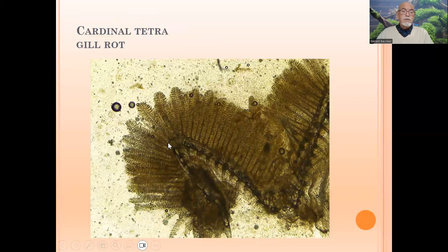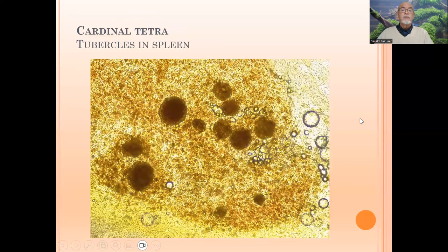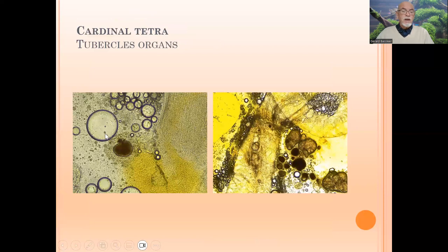Here some parts are damaged, here is another damaged part, and here are some pale parts of the gills — so the gills are not in a healthy condition. Inside the organs we found tubercles here in the spleen, and we found more tubercles next to the intestine, and also here next to the intestine in the mesentery — whole tubercles, a lot of them.